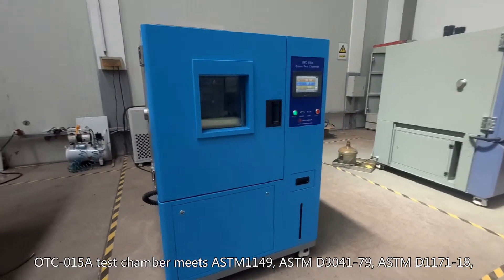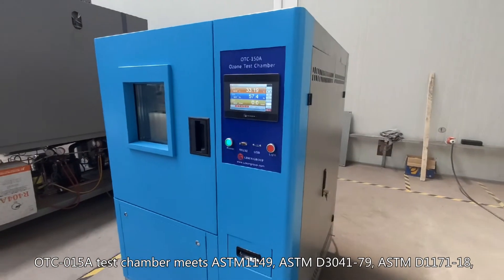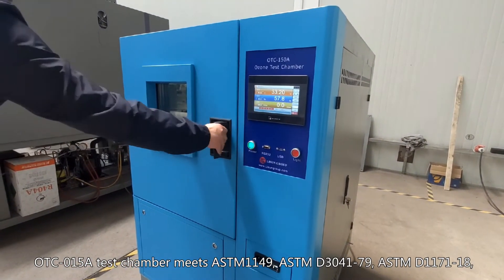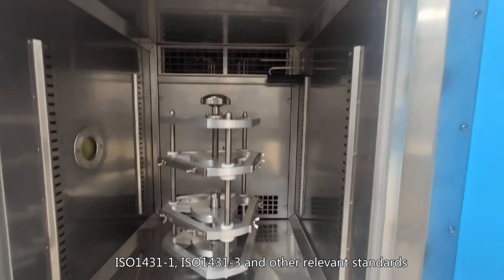The OTC-150A Test Chamber meets ASTM 1149, ASTM D3041-79, ASTM D1171-18, ISO 1431, and other relevant standards.